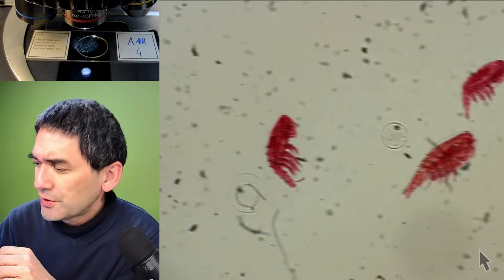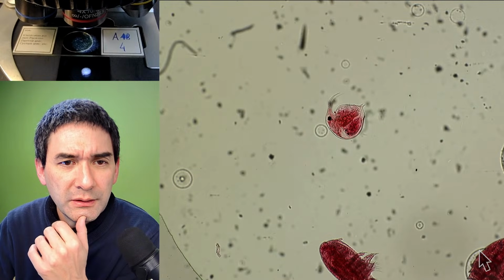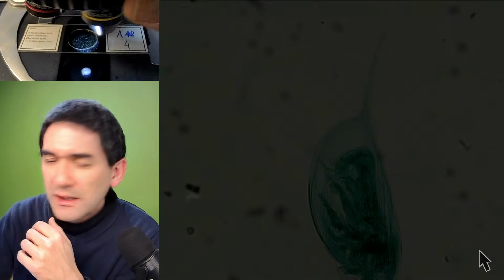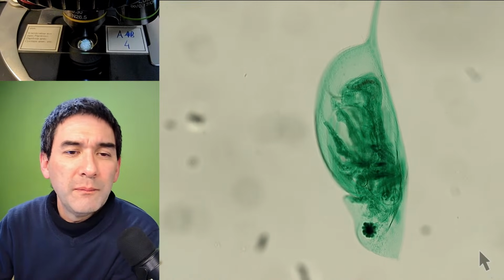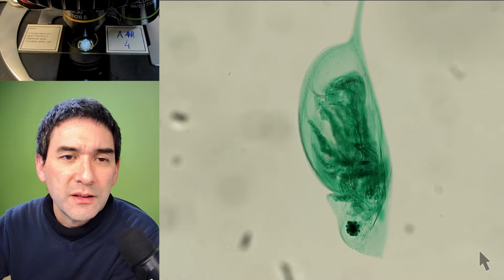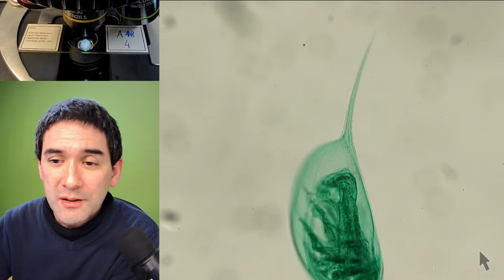Let me see, there were others as well. The green ones, I thought. Okay, no, maybe it was a different slide. That's an interesting one over here. Ah, here's the green one. I see that this slide over here is a little bit, yeah. I've got some live Daphnia. We've watched them already quite often, but they move around quite a bit. So having them preserved and stained like this sometimes makes observation a little bit easier.